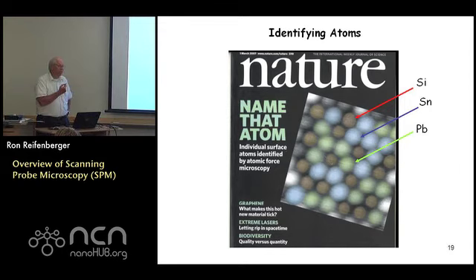So this to me is just unbelievable. This is really good work because it's really getting down to the nanoscale, and it allows you to start to color atoms. So if you ever wanted to know the difference between a silicon and a tin atom, well, one's red and the other's blue. So, very nice piece of work. In my opinion, there's nothing better than this.